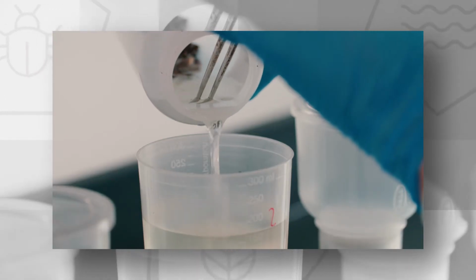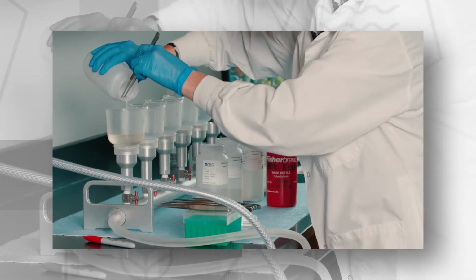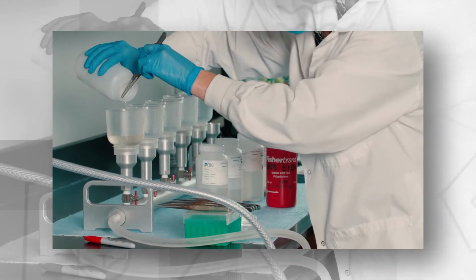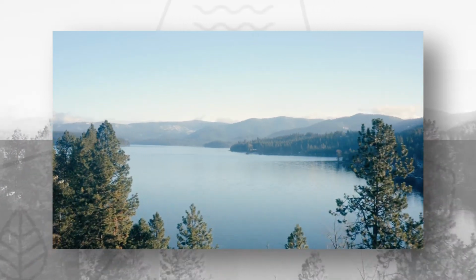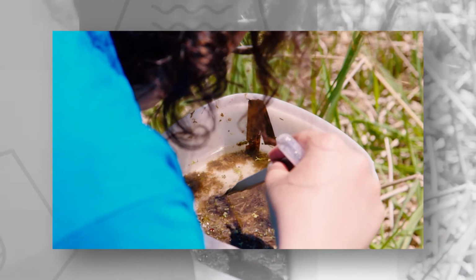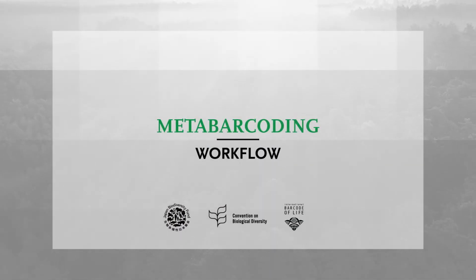While some of the lab process is similar to DNA barcoding, metabarcoding looks at the presence of DNA within a community of organisms. So if you were looking for the presence of an invasive species in a lake, for example, DNA metabarcoding of water samples could be an effective tool. This video will present one workflow for metabarcoding bulk insect samples collected with malaise traps.